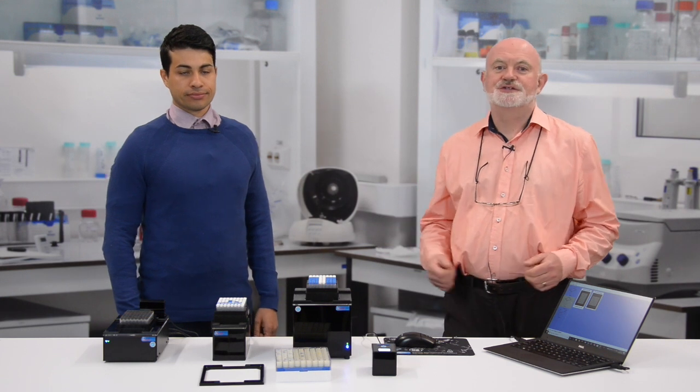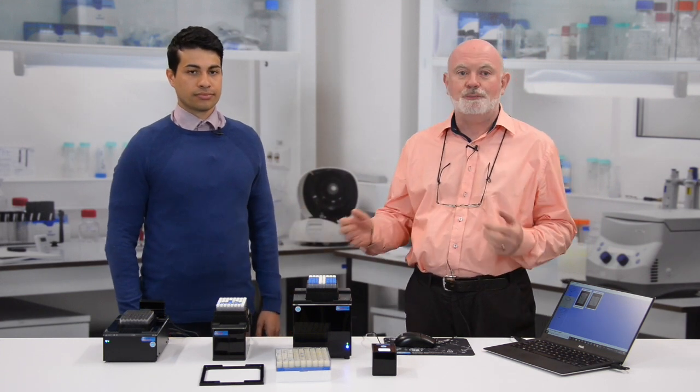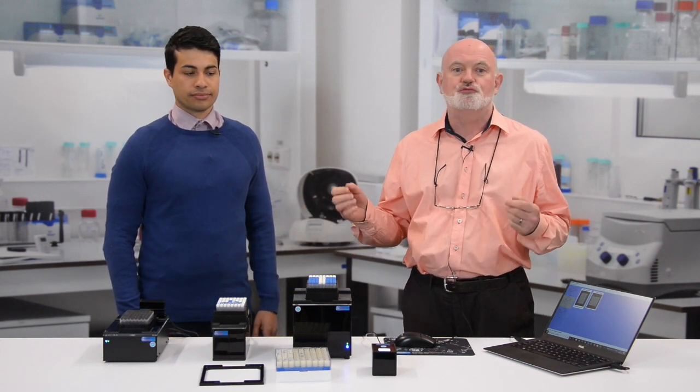Hello and welcome to the Ziath Research Laboratories here in Cambridge, United Kingdom. I'm Steve Knight, Commercial Director, and with me today is Avash Anderson, our Support Engineer, and we're going to take a look at Ziath's world-beating range of camera-based 2D barcode readers.